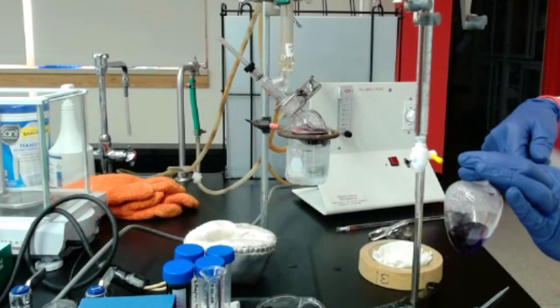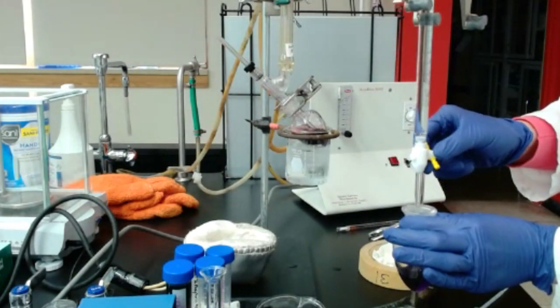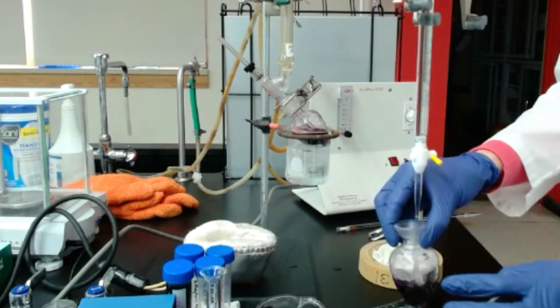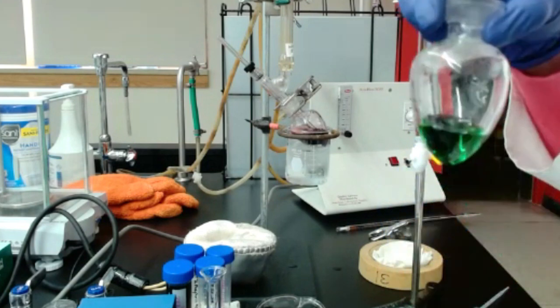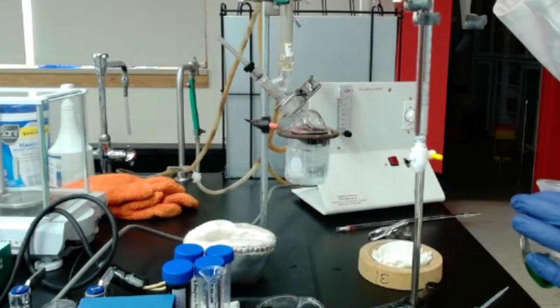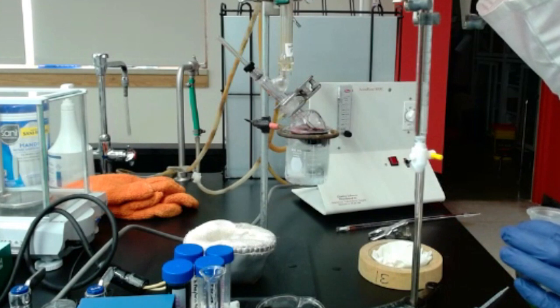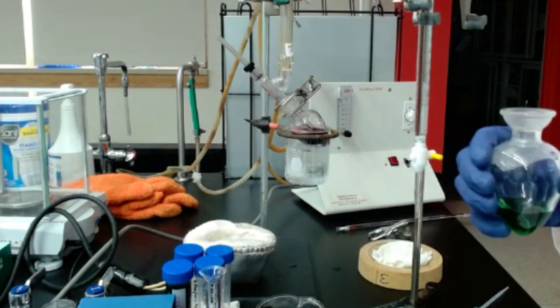And then I come with that flask at the bottom of the burette and I add drop by drop. So I open the tap and I add a little bit until, look at that, it's back already to green. And so I record again the final volume I have in my burette, and I have 22.8. That's my final volume.